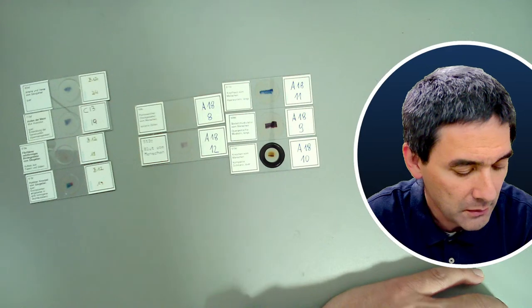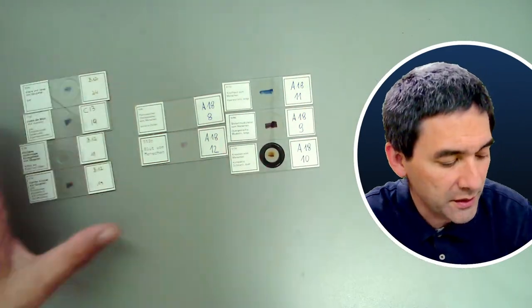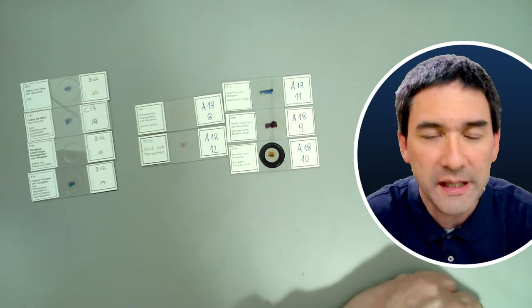So what I'm going to do is I'm just going to put them under the microscope, and we're going to have a look at a few of these slides here. Some of them are explicitly labeled human, others are basically just from mammals, and I can look also at a couple of others from the slide box. And that's basically it.